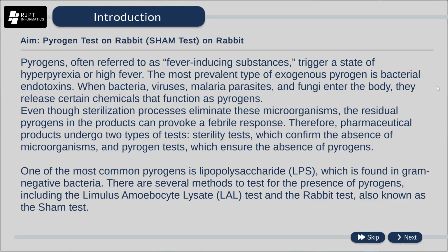In this video, we will study the pyrogen test on rabbit by performing the SHAM test. At the end of this video, we will be able to tell whether any product is safe or not before using it or after using it by performing the pyrogen test on it. So now let us start with the video.